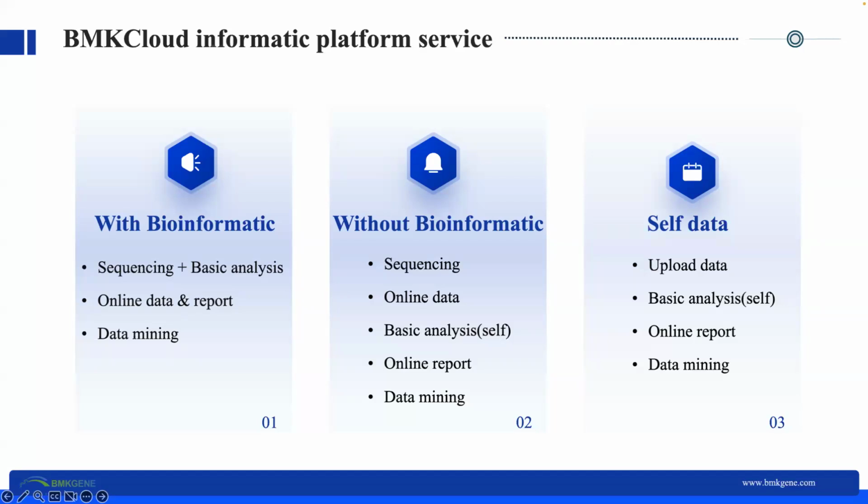For data sequenced in-house, we can push data or report into your BMKCloud account, and you can try the functions online by yourself. For the users with their own data, you can upload your data into BMKCloud by yourself. But we recommend opting for data analysis on BMKCloud to avoid significant time consumption of data transmission and instability caused by network fluctuation.